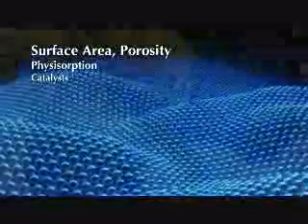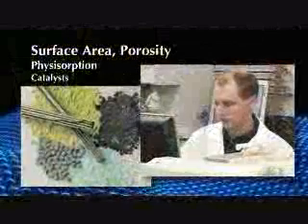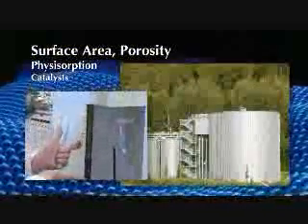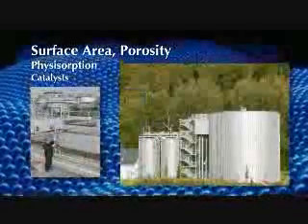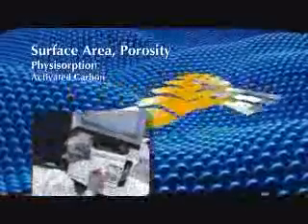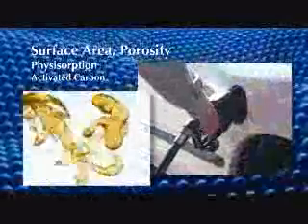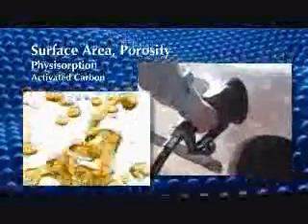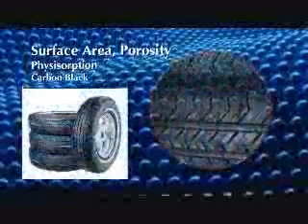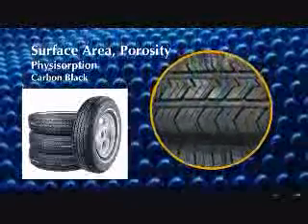The active surface area and pore structure of catalysts influence production rates. Limiting the pore size allows only molecules of desired sizes to enter and exit, creating a selective catalyst that will produce primarily the desired product. Surface area and porosity must be optimized within narrow ranges to accomplish gasoline vapor recovery in automobiles, solvent recovery in painting operations, or pollution controls in wastewater management. The wear lifetime, traction, and performance of tires are related to the surface area of carbon blacks used in their production.